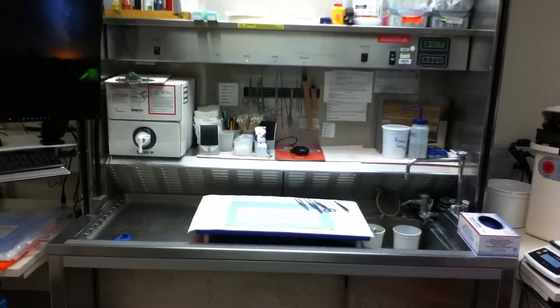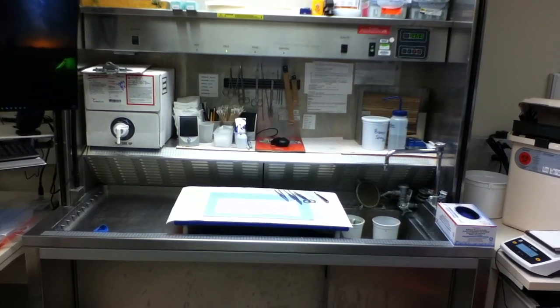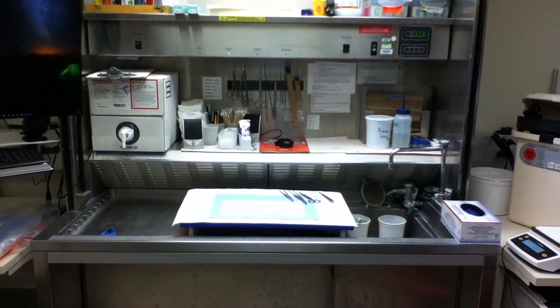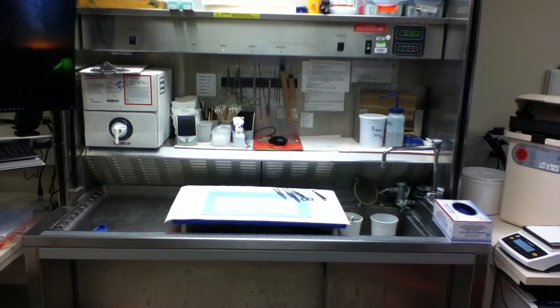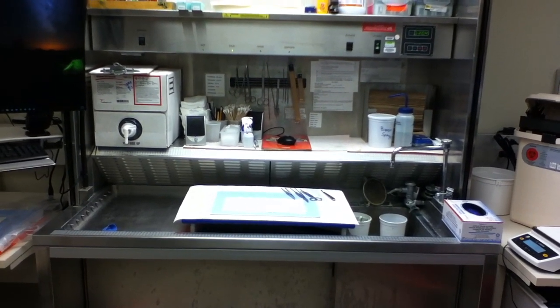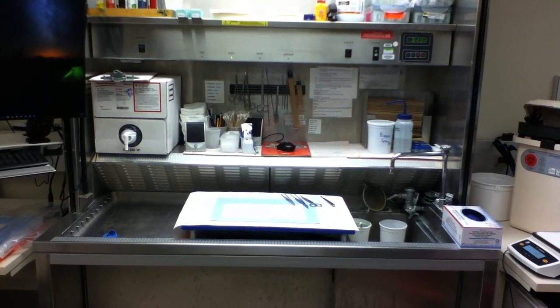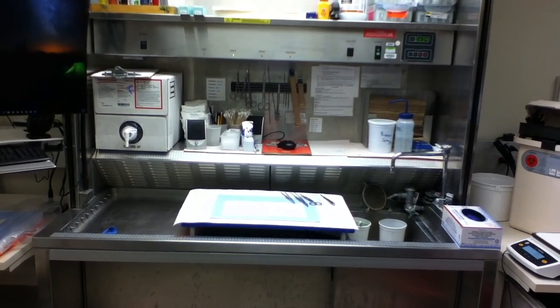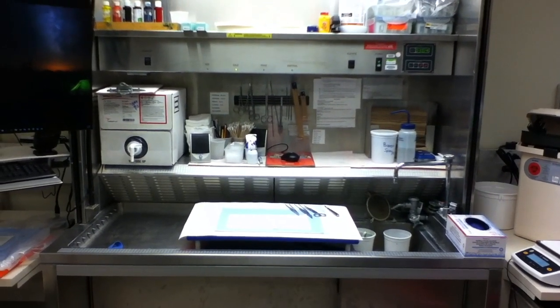Hello everyone, I'm back shooting a quick video today about how I set up my grossing bay — the best things I like and maybe some ways you can improve your grossing bay setup. I want to do a two-video series: the first is just how I set up my bay, what I have, what I like and don't like. The other part I want to do is grossing for comfort and safety.